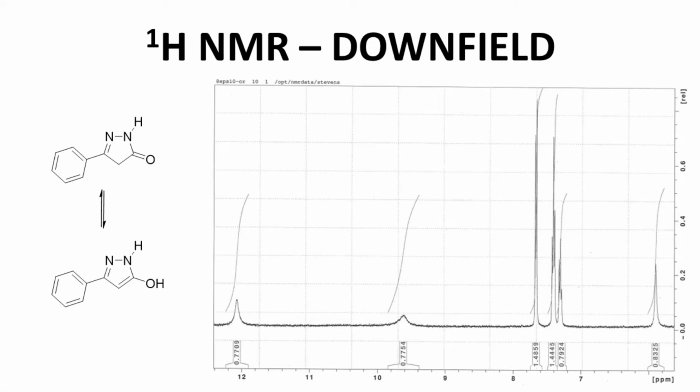from them. Remember that our integrals are interpreted as a relative intensity, not the absolute number under the peak. So our leftmost peak has a value close to about 0.75. This is not 3/4 of a hydrogen. This is 1 hydrogen. So our leftmost peak is 1 hydrogen. So for the rest of the spectrum, for every 0.75 value of integral, we know that equals 1 hydrogen on our molecule. The next signal is about 0.75.